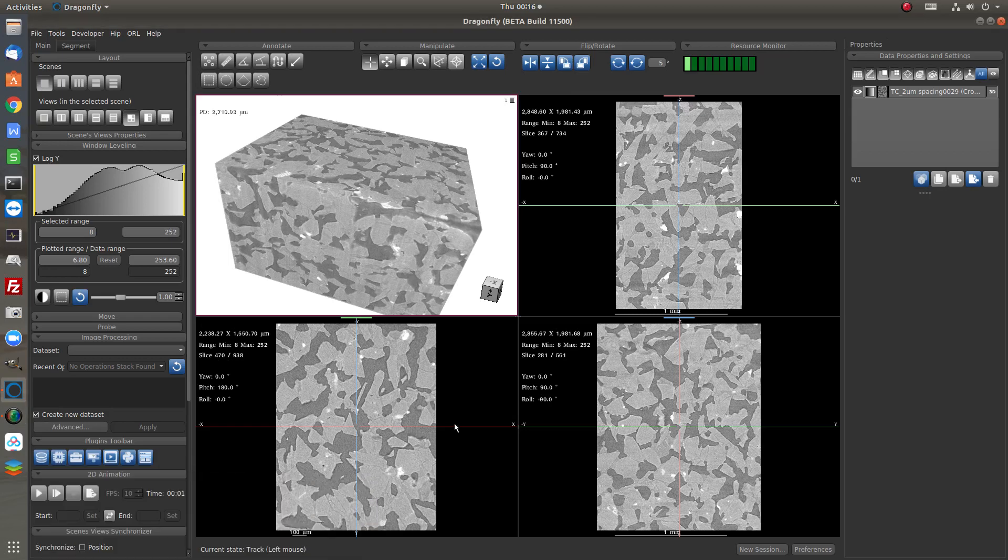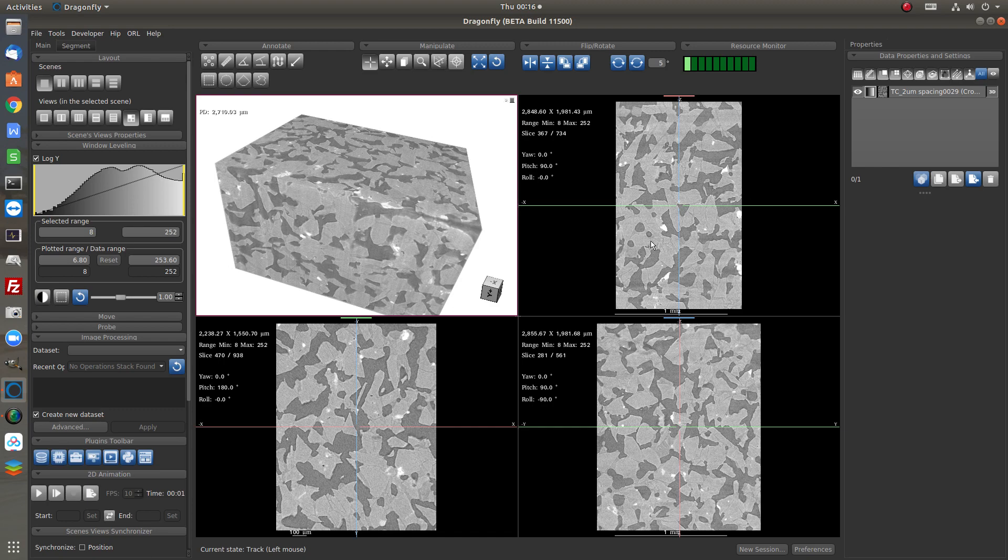This short video will demonstrate the basic workflow to use Dragonfly for modeling the pores in a porous material using the CT images.